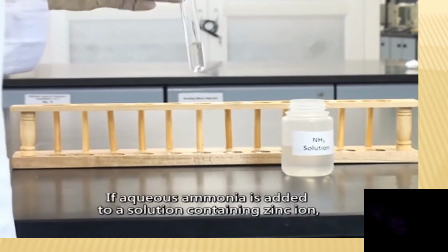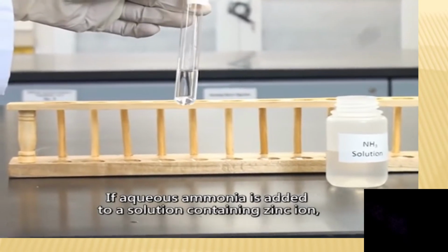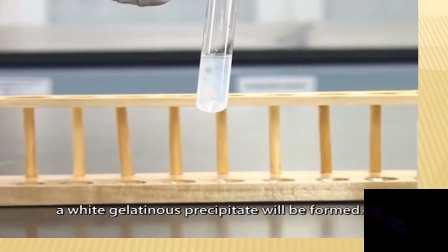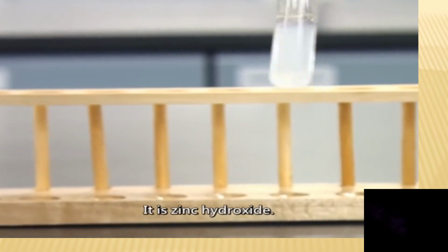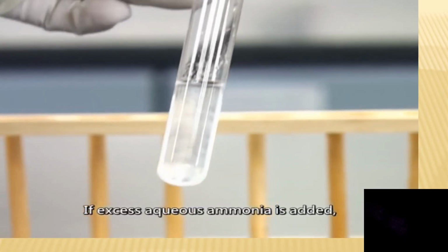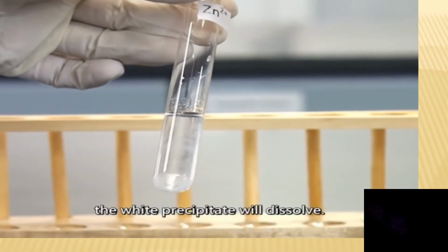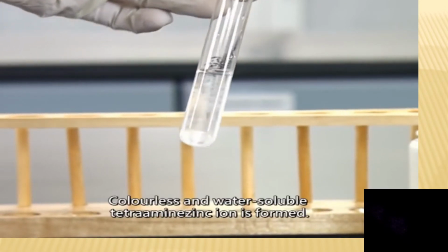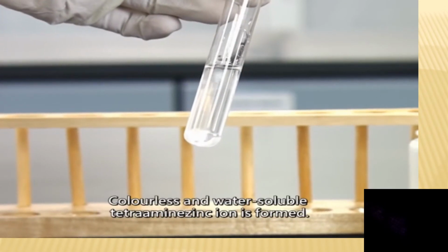If aqueous ammonia solution is added to a solution containing zinc ion, a white gelatinous precipitate will be formed. It is zinc hydroxide. If excess aqueous ammonia solution is added, the white precipitate will dissolve. Colorless and water-soluble tetraamine zinc ion is formed.